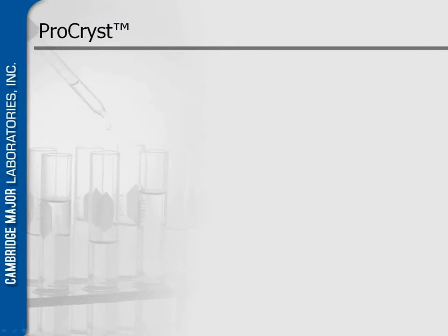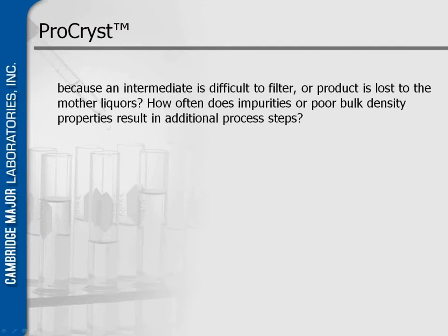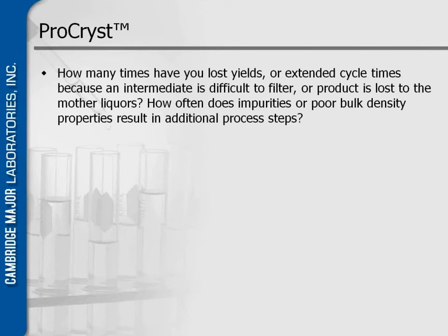The second approach that we have is when, next to the choice of the form of the compound, you also have to develop a process. So when you have a problem with the yield that you get, or you don't know exactly when the end of your reaction is, you possibly have something which is very difficult to filtrate, and impurities of each batch are different, or you just have a poor quality material.